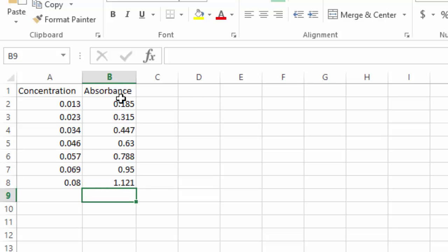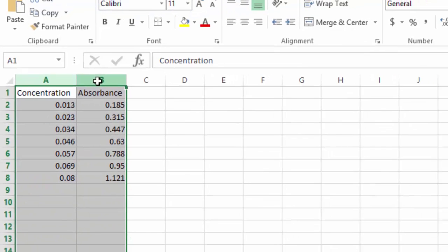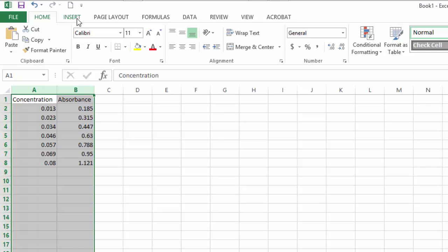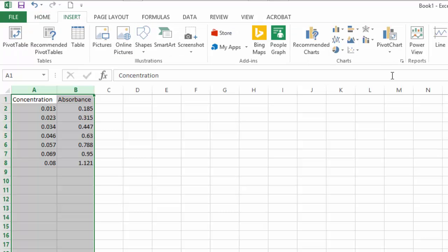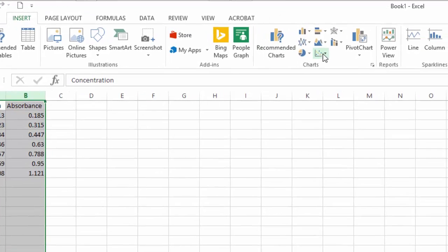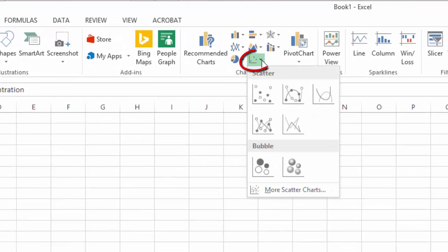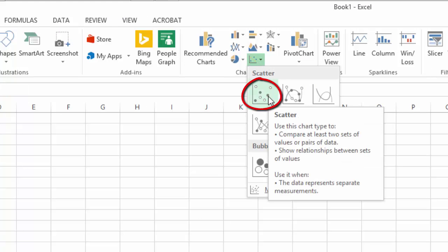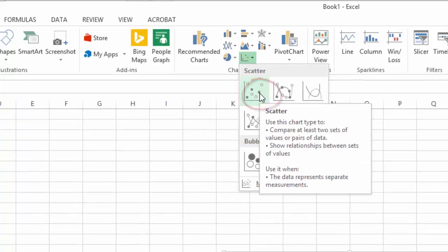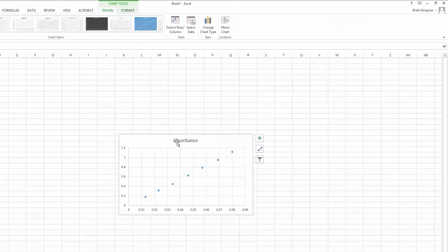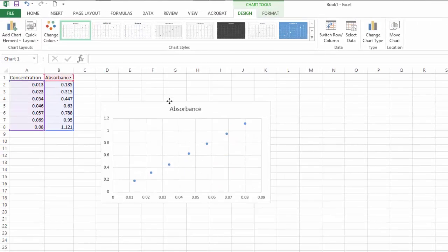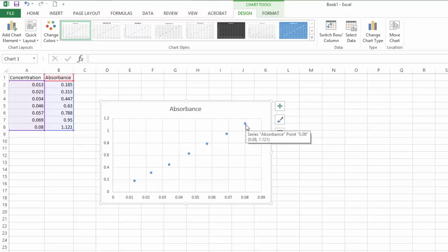Once I've got those typed in, I can highlight the two columns, go up to Insert, and what I want is the scatter plot — specifically a scatter plot without lines. I'll click on scatter to make my plot. You can see that's a pretty linear plot.